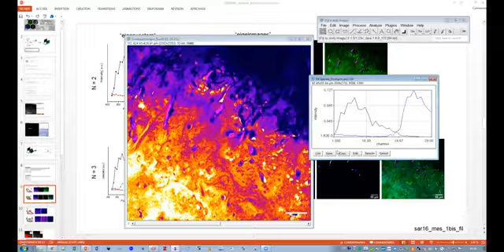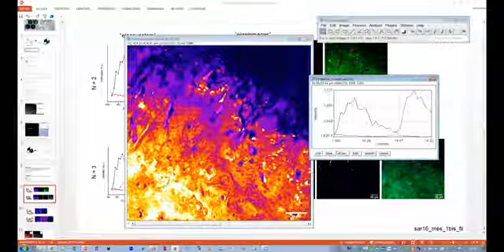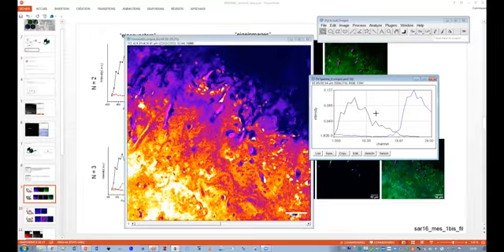Okay, but this on the left, it's the eigenimage corresponding to the first eigenvector. And in this image, what is the reason for the contrast? It's intensity differences. What is getting different colors?